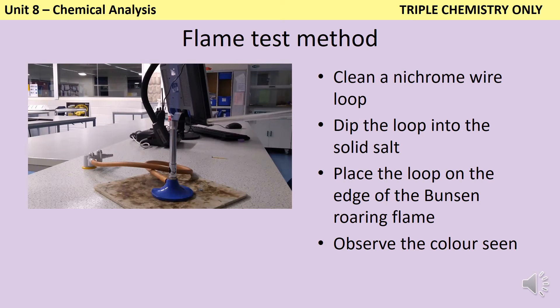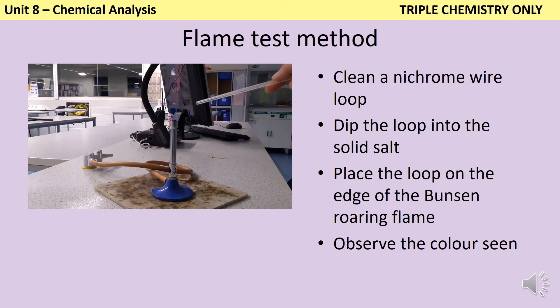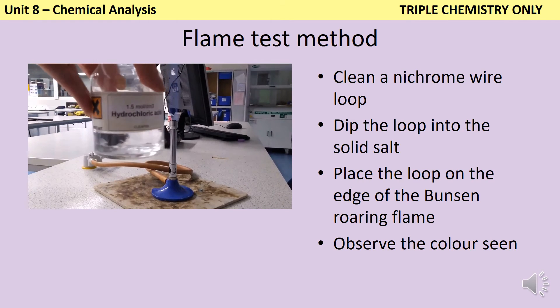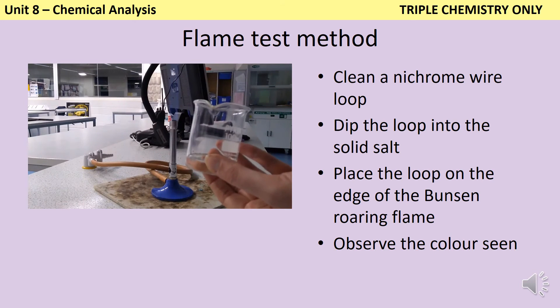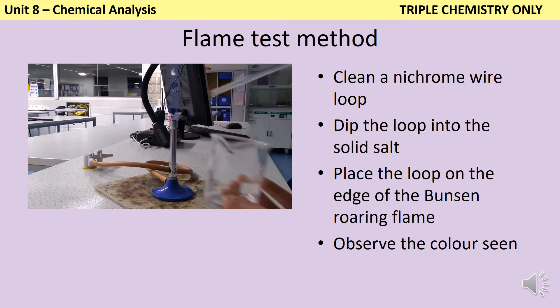The first step in carrying out a flame test is to clean a nichrome wire. We use this nickel and chromium alloy because it has a very high melting point and because it doesn't produce a flame colour of its own. We use a Bunsen burner to remove any dust, and then place the wire into a small beaker of hydrochloric acid. The acid will react with any leftover metals from a previous test, removing them, so we can be confident that the flame colour we're seeing is just from the new compound. The hydrochloric acid will also moisten the wire, allowing us to easily pick up a solid salt, although you can also do this test for solutions — you just tend not to get as bright a colour.